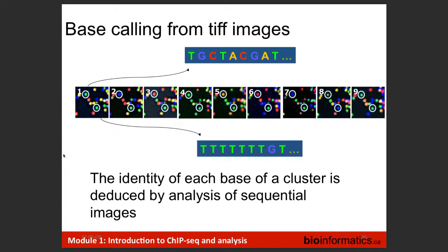But a typical flow cell has 8 lanes, although there's various configurations now. It doesn't really matter. But we take this tile, we break it into X and Y, right? So we have X, Y coordinates, and the focal map essentially assigns, for every position that it's getting a signal for, an X, Y position for that cluster, okay? And as I'll show you, that XY position becomes encoded in the sequence name and is how we keep the sequences straight throughout the rest of the bioinformatic process.